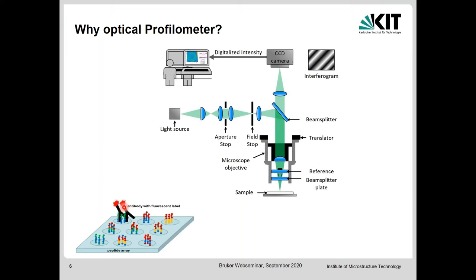By chance, it was only by chance that we have a Bruker optical profilometer at our institute, and we just wanted to try it for label-free detection of antibodies, and we were surprised by the results.